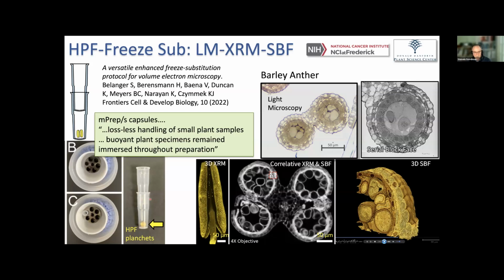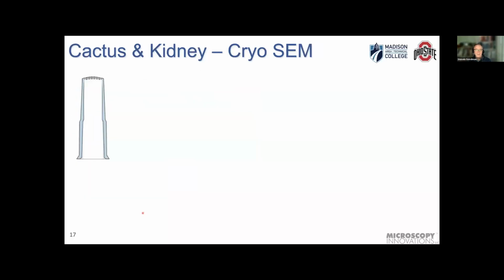because the fluid level is always above this height here where the two capsules are stacked. So it's an advantageous approach. They used a manual preparation, but an automated preparation could be done. They do not have an ASP.